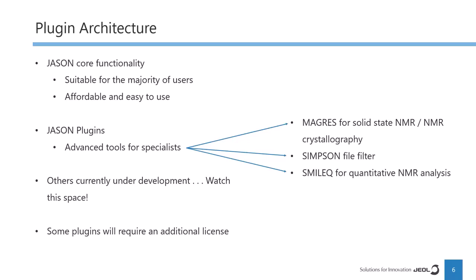It's designed to be affordable and easy to use. But we're aware that there are lots of tools that specialists might want to use. More advanced analyses, more focused on particular applications. And this is where the plugins come in. The idea here is that we can effectively package the functionality within a plugin, and it means that if you don't need those particular tools, you never need to worry about them.